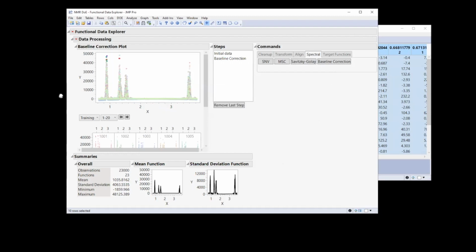So this has pulled out that baseline. There isn't much of a baseline here, so it wasn't a huge change. But if there is an underlying exponential shape or underlying large Gaussian peak that belies all the others, it'll nicely clean that up.